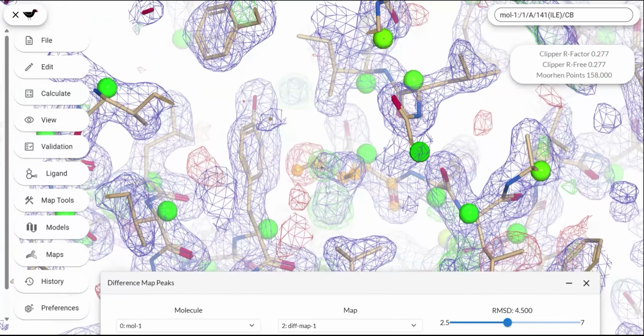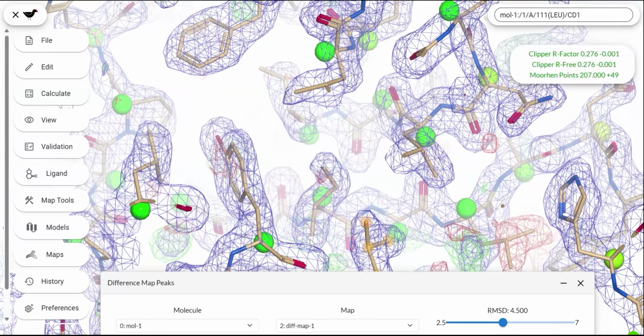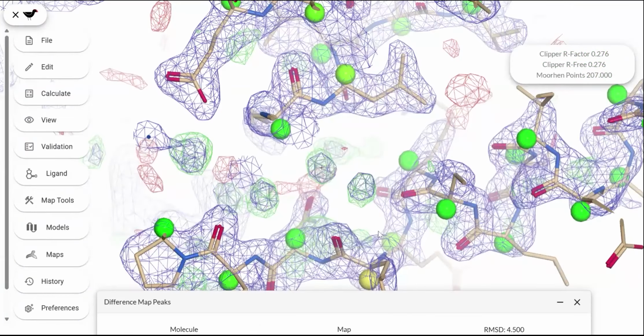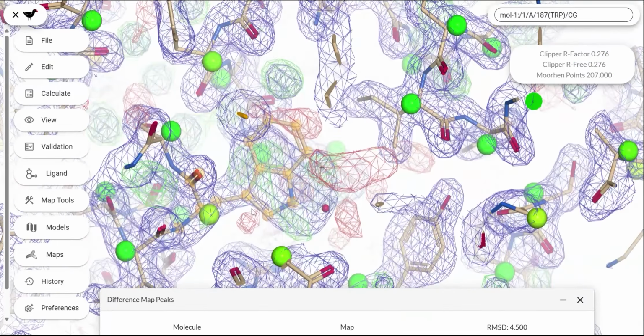Yeah, this one's a good one. We can also do the rotating over here. There we go, significantly better. You just go around trying to fix as much of the issues as possible. Oh yeah, like this one. This is a good one.